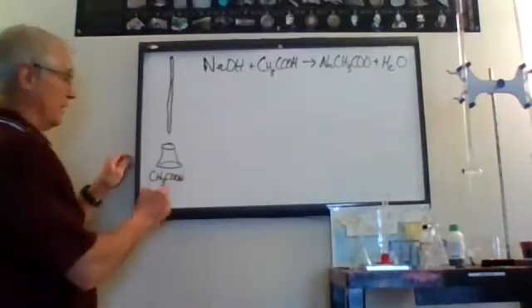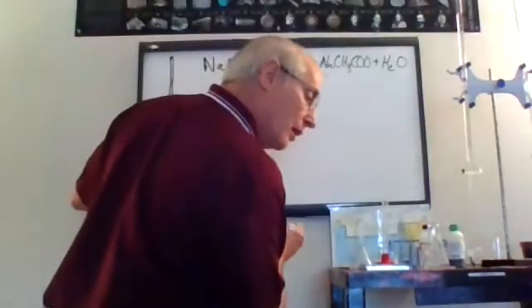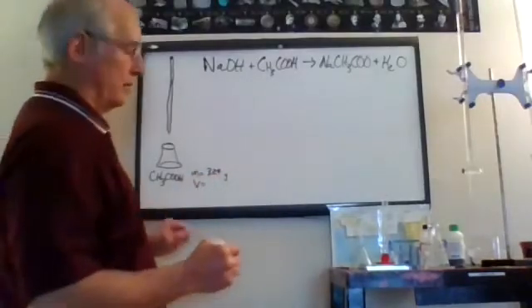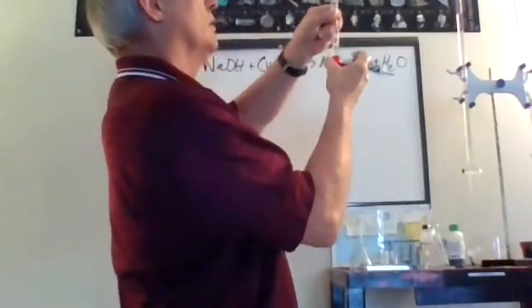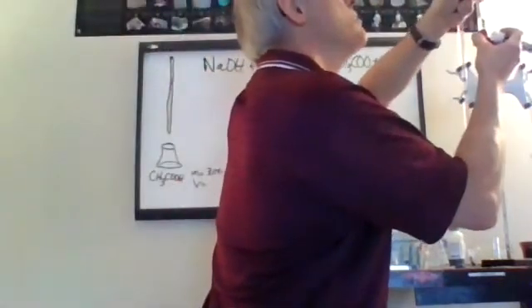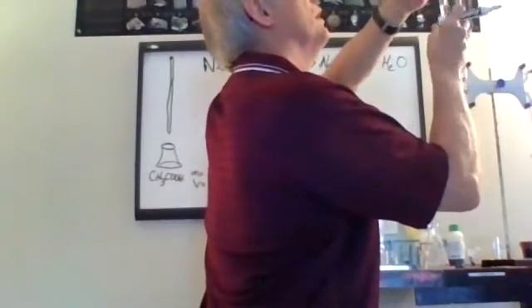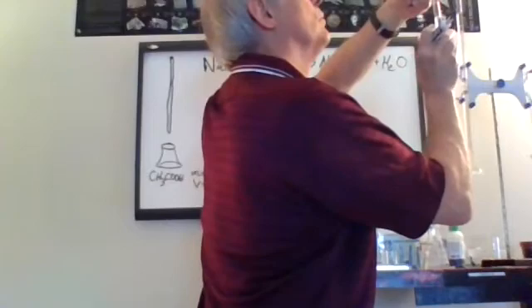And the mass of this vinegar is 3.24. And the volume of this vinegar is 3.21, I think. 3.21.